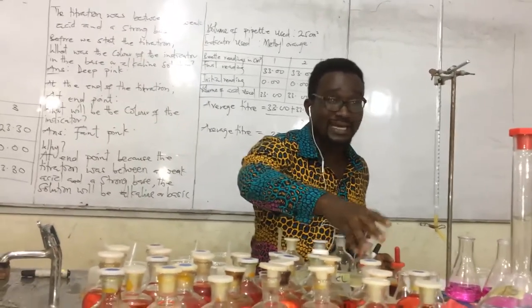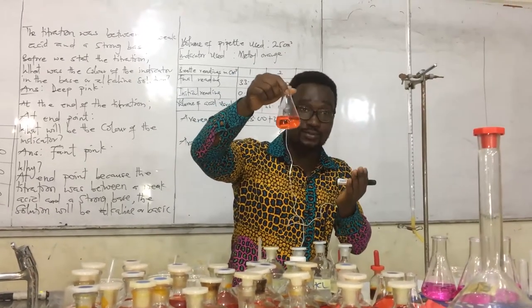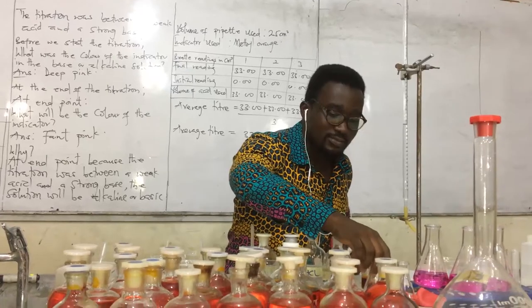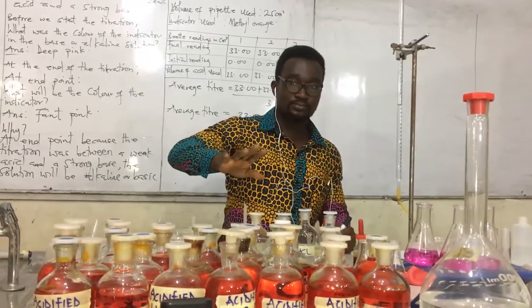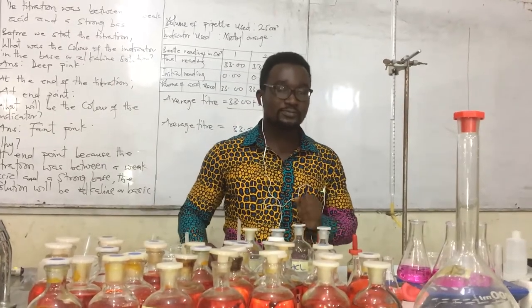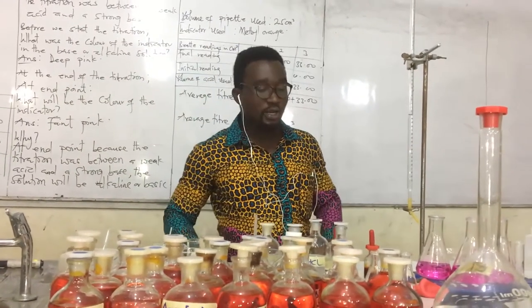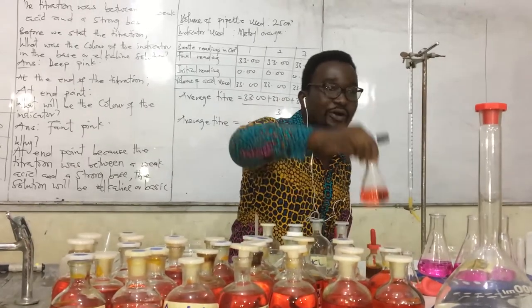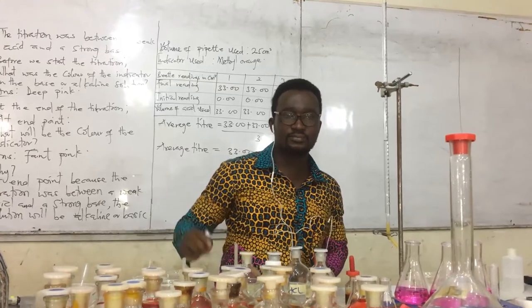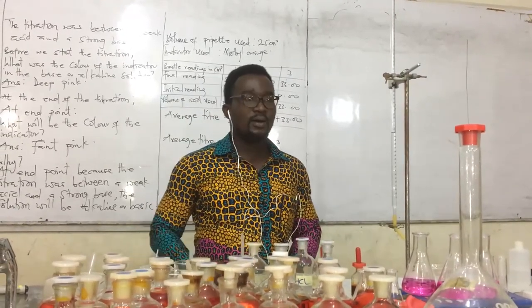In fact, some people have a problem with color. So they can't identify color. Some people will see this one as red. It's not red. This is orange. That is why I even advise that you can go to Google and punch in orange color. It will give you the category of orange colors. And you see that they are within the range of the colors I've shown you from our desk.